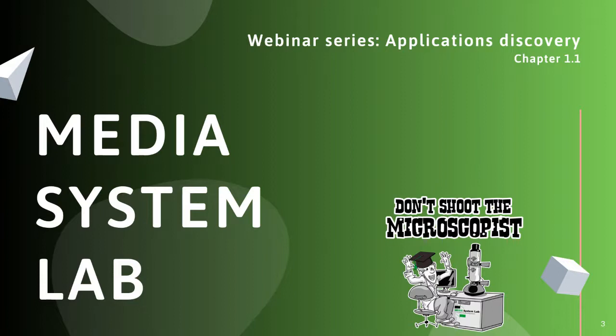My name is Luca Clario, and in this section I will speak about Nanolive 3D Cell Explorer Fluo dedicated to nanoparticle studies.